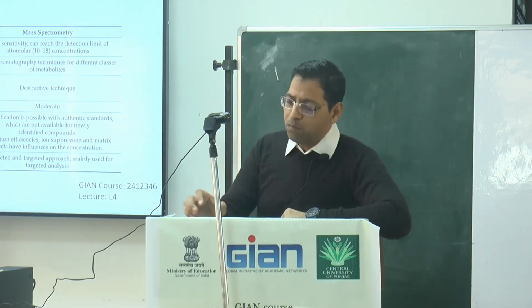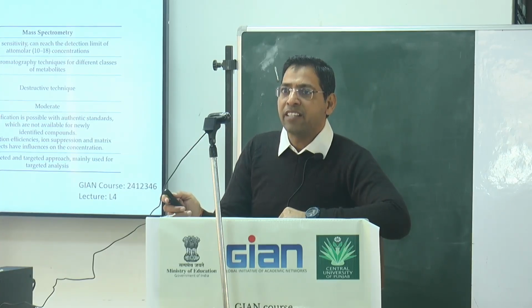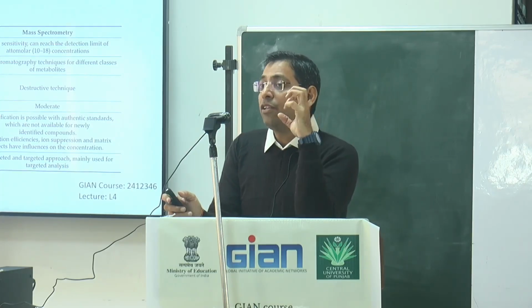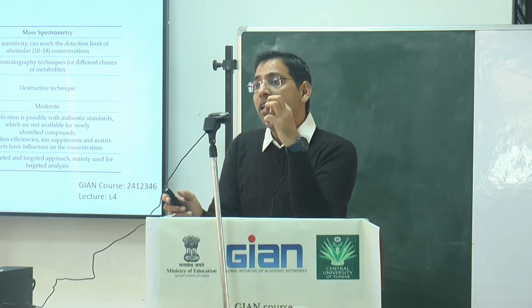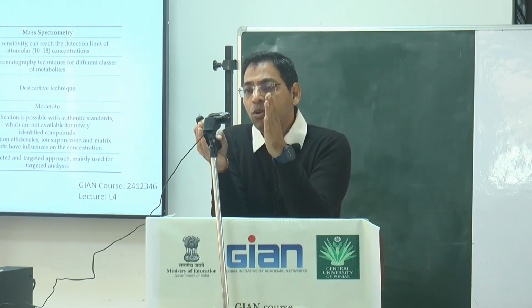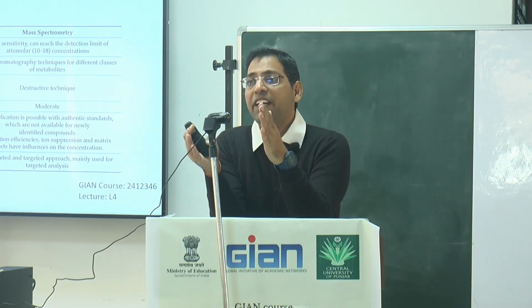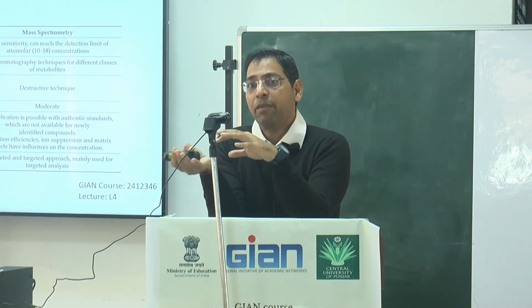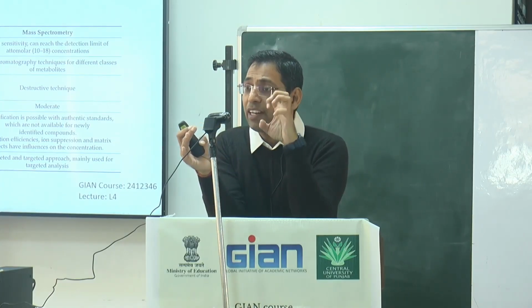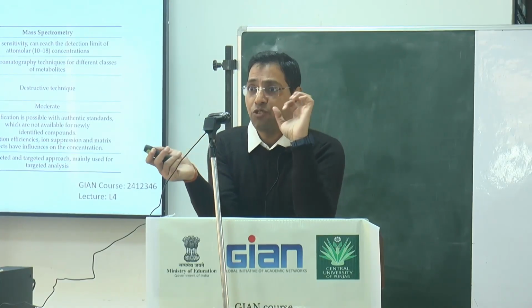Yes, you can use both with the spectroscopy. LC-MS is also used for targeted and non-targeted analysis. But if you are using LC-MS and NMR also, and you can validate both data sets, it shows the validity of your data, how strong your finding is. If it can be done by any machine and you are getting the same pattern, it means you have really captured the biology of that particular biological situation.